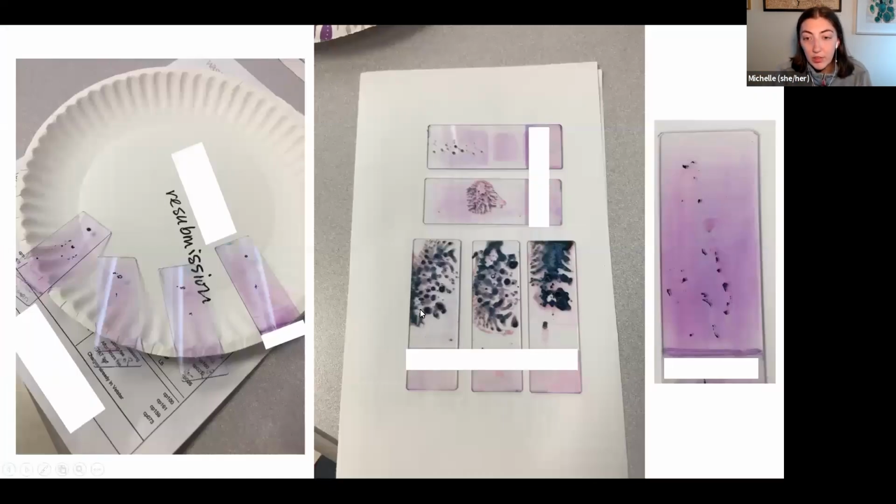These are some examples of other samples that I got that were just too thick. Additionally, sometimes that's just the way the sample is; it comes out and splatters on the slide. What I suspect happened here is they splattered the slide and didn't try to smear it right away. So when they went to smear it, it wouldn't smear, because there was so little sample that it dried almost immediately. You have to be ready to smear the samples, especially when you have a very small amount like this. It's going to dry quickly, and if you wait, when you go to smear it, you're not going to be able to.